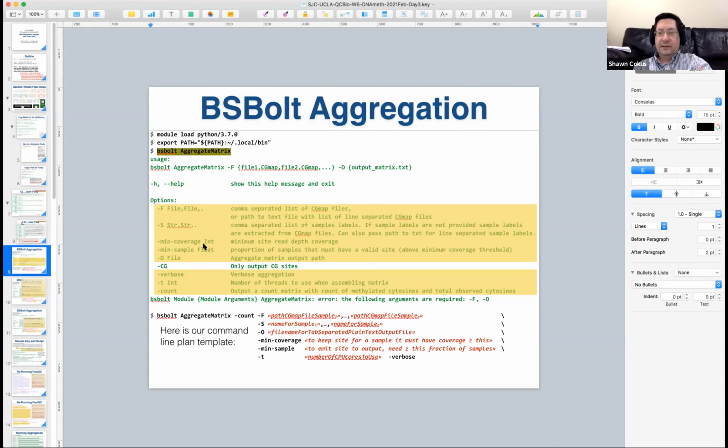And if you set it to something in the middle, then we have to talk about how this translates from a fraction to the threshold, which is where the bug comes in. Say we've got 6 samples, and you set it so that it means 5 or more samples.